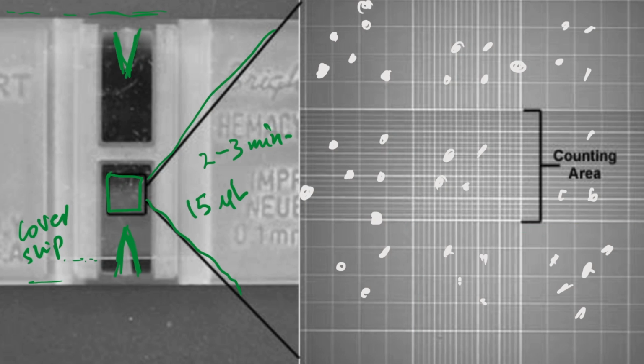And we have our cells lined up here. What I'm also going to do is put in some more cells in blue color, almost everywhere. So for one reading, and this is what's typically done, 5 squares are chosen for one chamber.